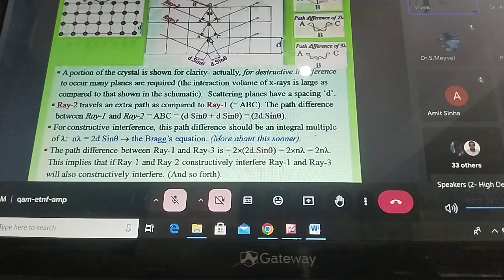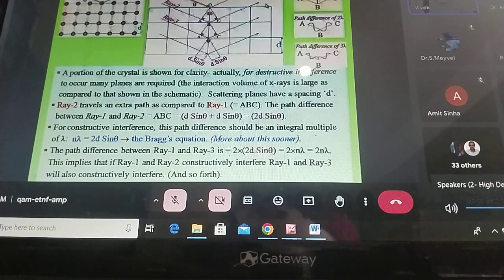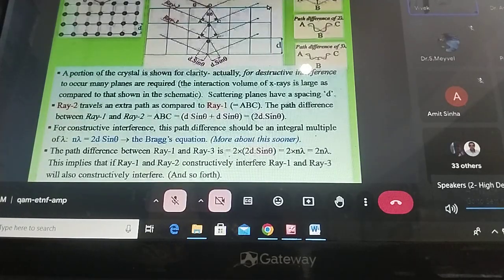What we are doing is allowing X-rays to fall on the sample, and we are getting whole information regarding how atoms, ions, molecules are sitting in the crystal, contained in this scattered part. So it is up to us to extract information of the unit cell, length of the unit cell, symmetry, point group, space group, how they are sitting, what the intermolecular interactions are, hydrogen interactions, CH-O, CH-pi, pi-pi interaction.